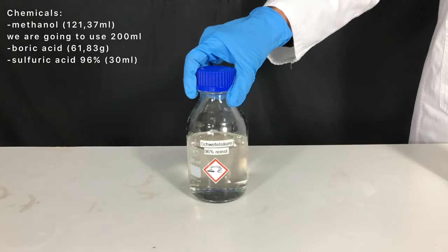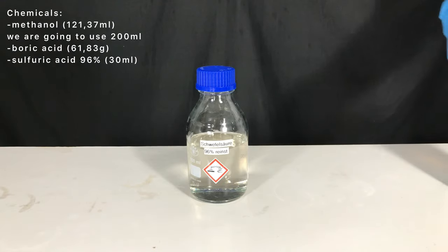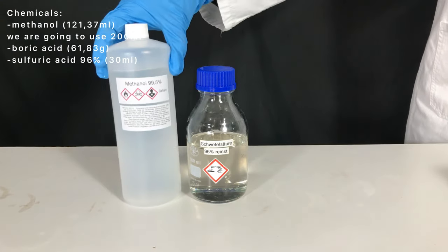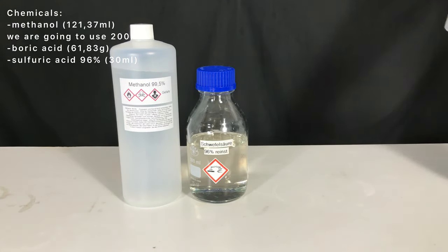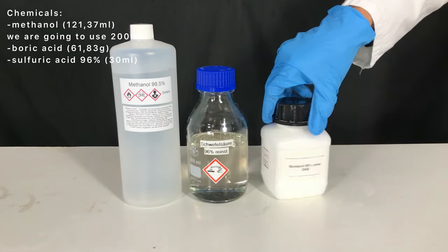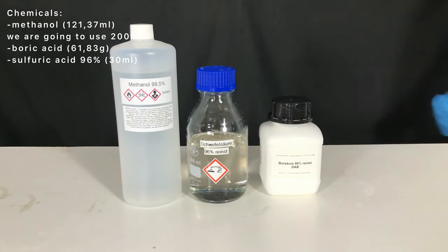Today we are going to make some tri-methyl borate. For this, 30 ml of sulfuric acid, 200 ml of methanol, and 61.83 grams of boric acid are needed.